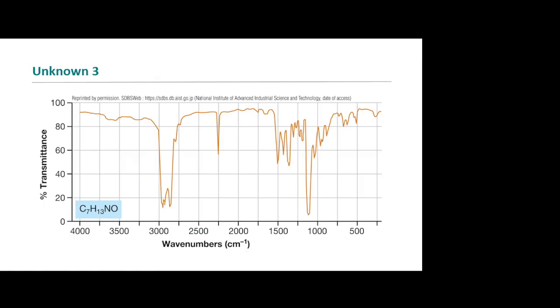Okay, so you have some sort of C triple bond. It's in this ring. We also have an oxygen here. Do we have any evidence for a carbonyl? No, we don't, do we? Do we have any evidence for an OH, an alcohol? No again, right?